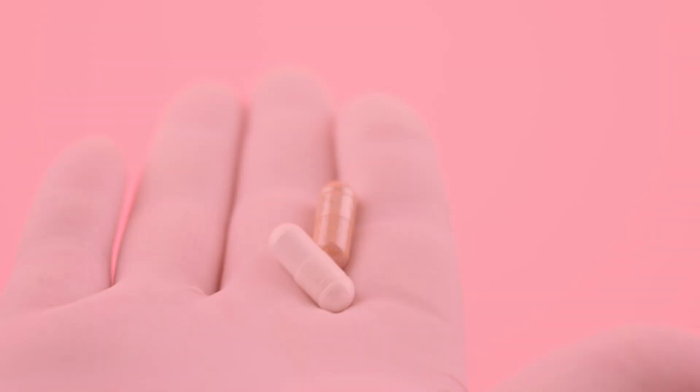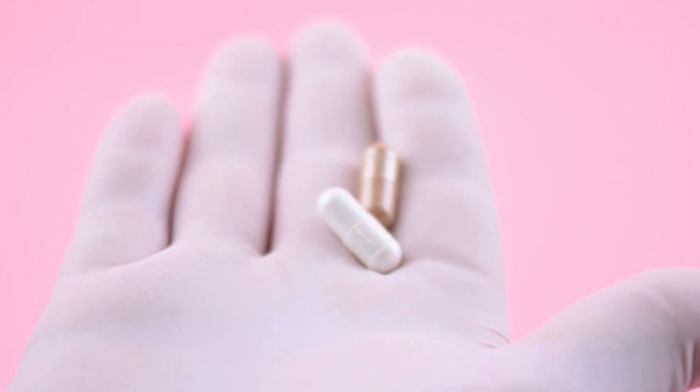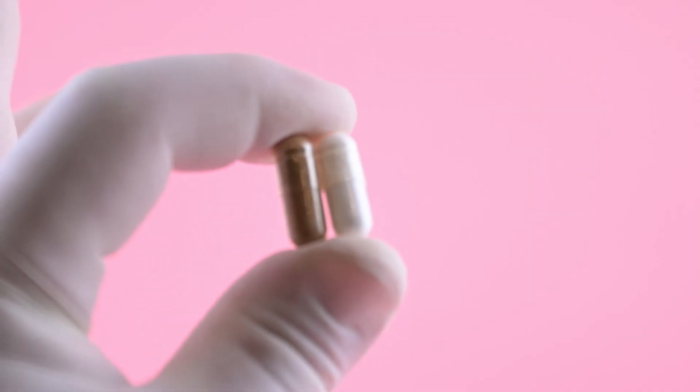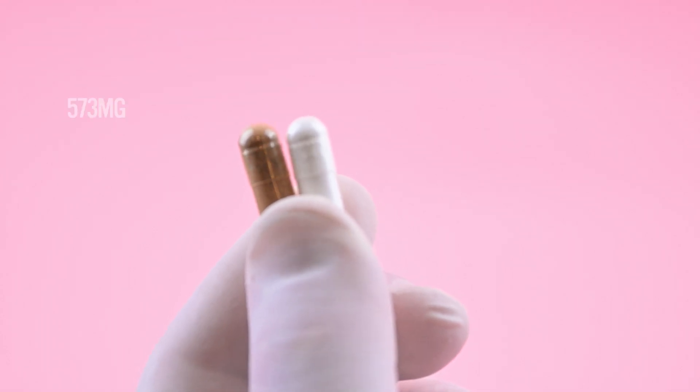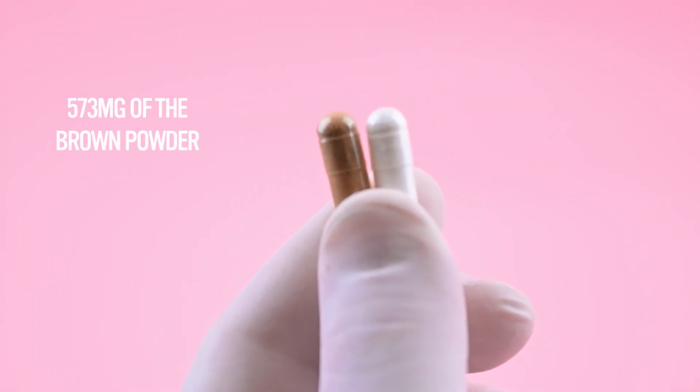But why is this necessary? These are two different supplements, both in a size 00 capsule. The first capsule holds 665 milligrams of a white powder, while the second capsule holds 573 milligrams of a brown powder.